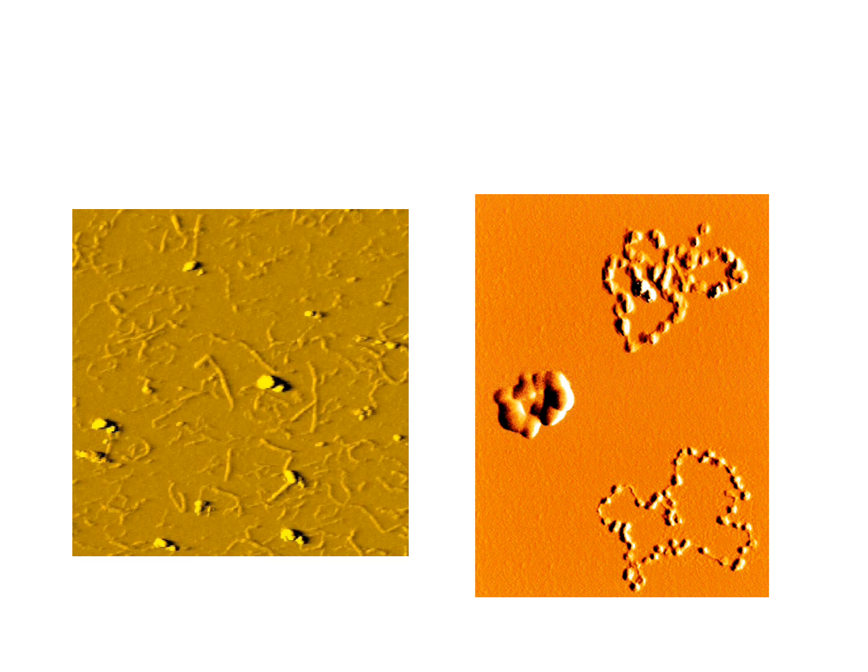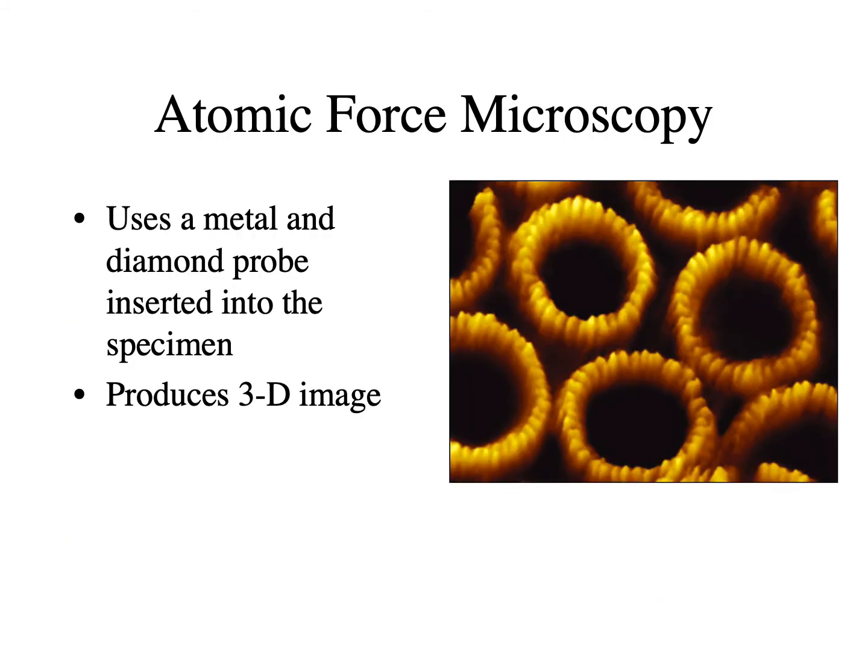On the left is pectin from apples. Pectin is like, if you make jelly or jam, you've used pectin as a thickener. But what's really cool about pectin is that it surrounds microbes, and it actually makes it easier for your immune system to dispose of pathogenic bacteria. So it is actually true that an apple a day keeps the doctor away. And the one on the right is just little rings of genetic material. It's just so cool to actually see that stuff.